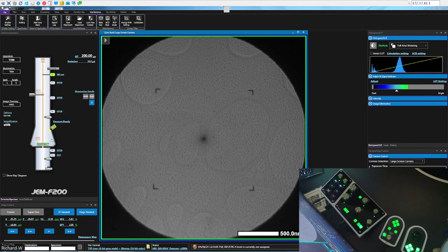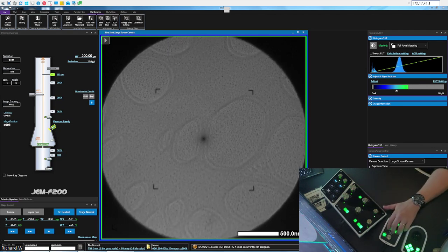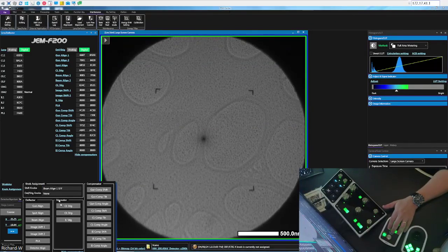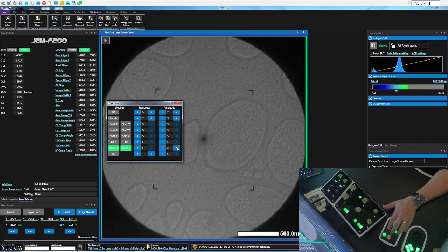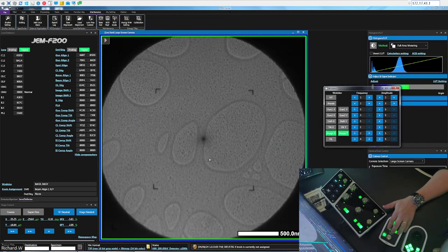There are other methods to focus the sample. You'll include an image wobble function, which if I press it and go out of focus, I will change the strength of the wobbler to make it easier to see. Okay. So you should see that the image is now shifting left and right and slightly up and down.